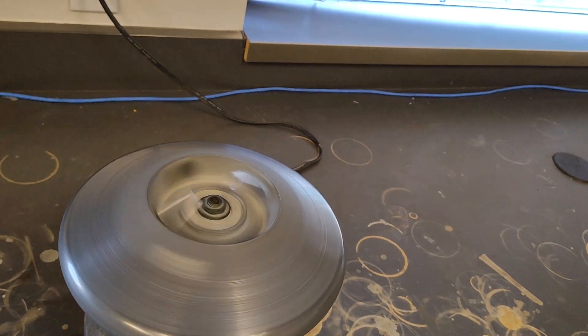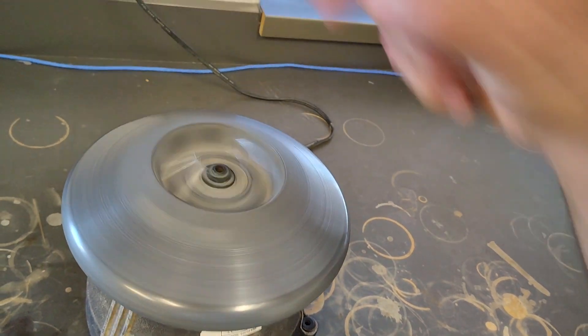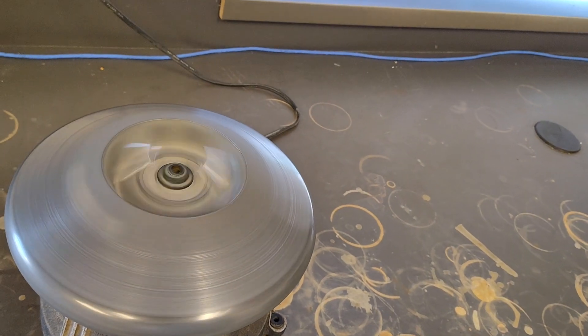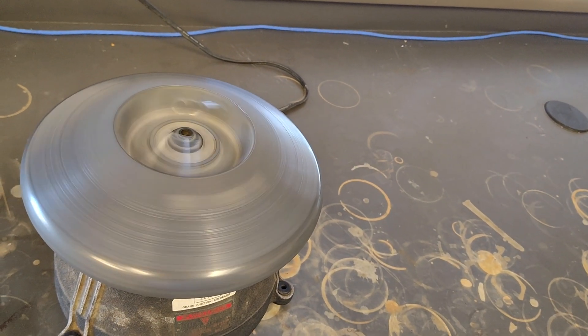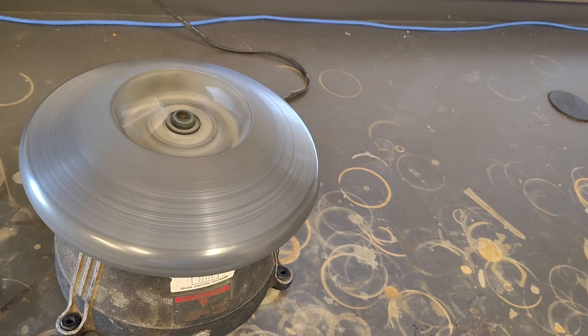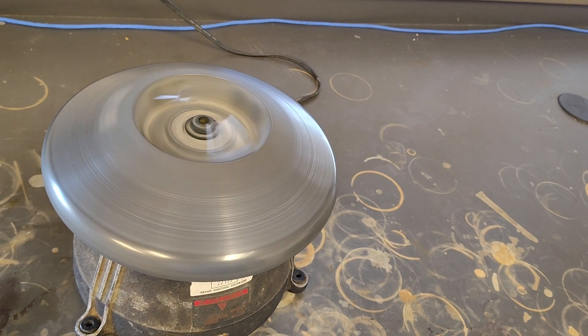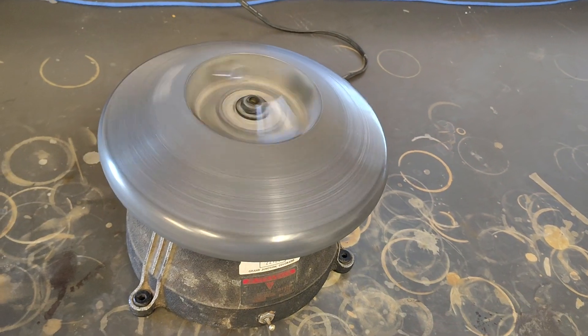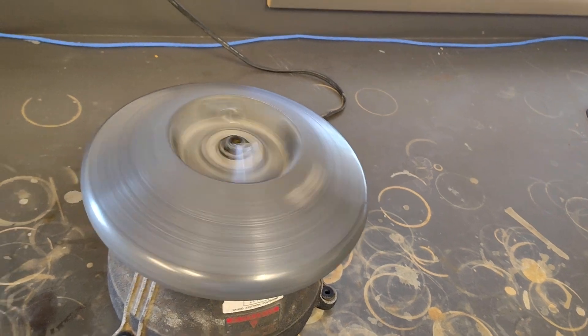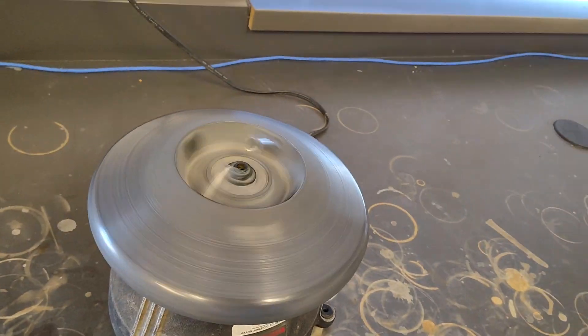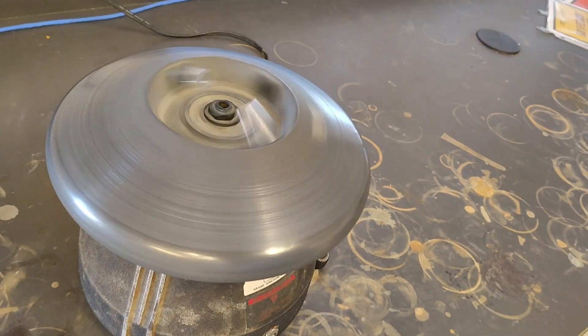Usually you should never touch the top because you don't know where the glass is right there. Most modern centrifuges have covers on them. This is from the 70s. You can actually see the streaks on here where people probably touched it and let it slow, but I'm going to let it slow. We're going to see how this worked here at the end.